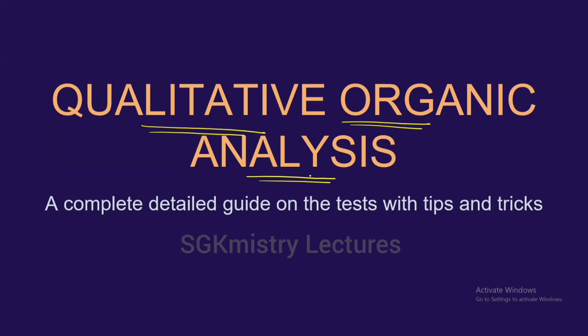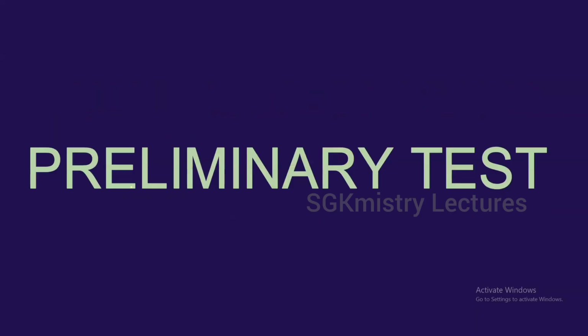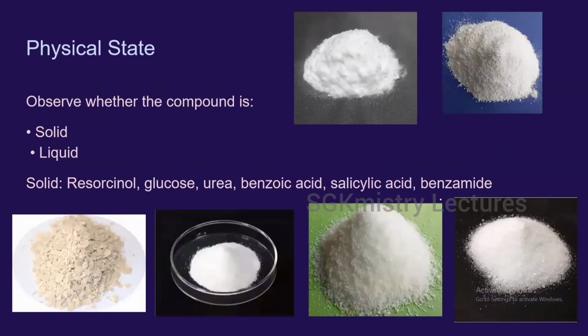So this particular video will serve as a complete guide for all the tests that are required to be performed under qualitative organic analysis. So let us start with understanding the preliminary test. First of all, in the preliminary test, we are going to identify certain characteristics and look into those characteristics in the given organic compound. Based on this, we can have a rough idea about what may be the given compound based on certain assumptions. Okay, so let us start with the physical state.